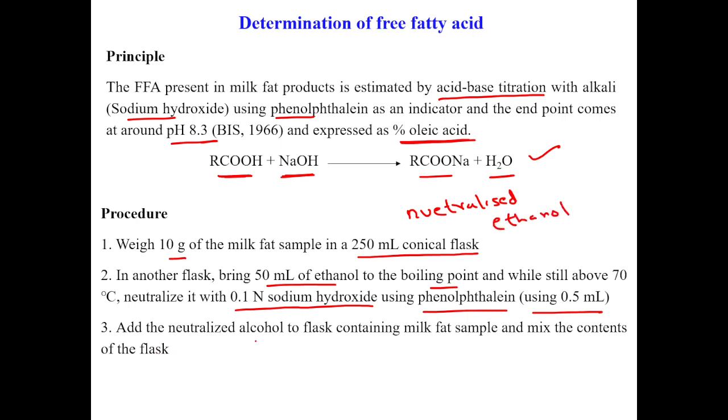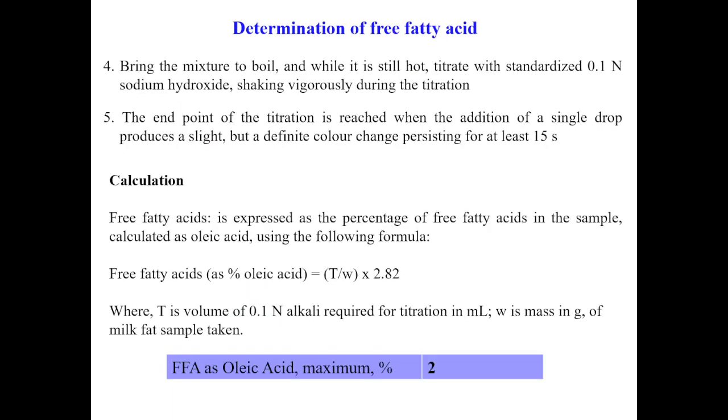Okay, now add the neutralized alcohol to the flask containing the milk fat sample and mix the contents of the flask. After adding the neutralized alcohol to the flask, you mix the contents.